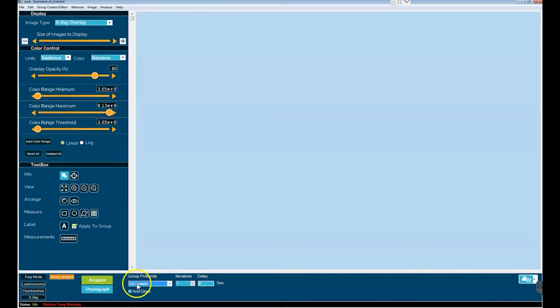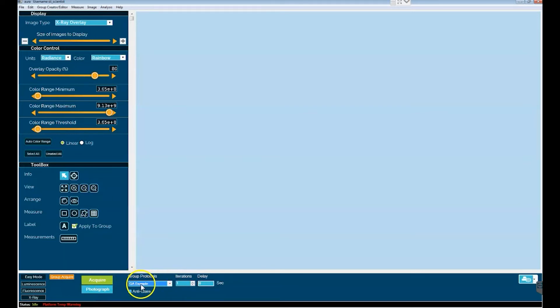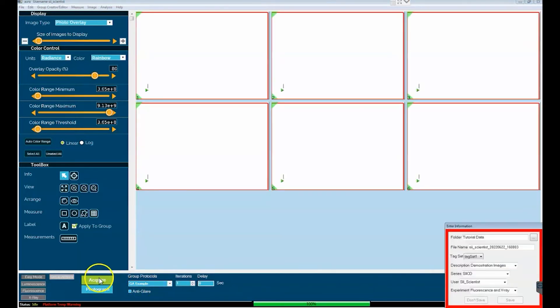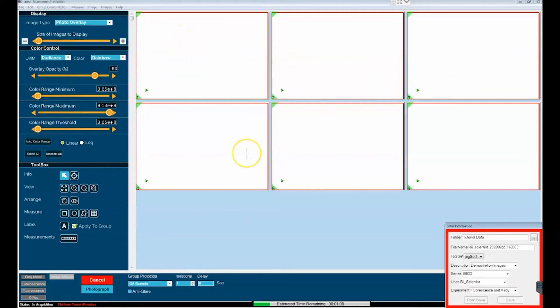So how does one go ahead and take a group acquire? We've just selected the group acquire acquisition type and we have our group acquire listed in the window designating which protocol will be used for the group acquire and we simply go ahead and click acquire. And what you'll see is now not a template for one image but a template for six as there are six image acquisitions in the group acquire protocol.